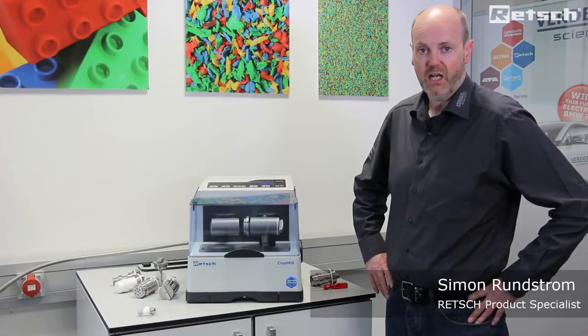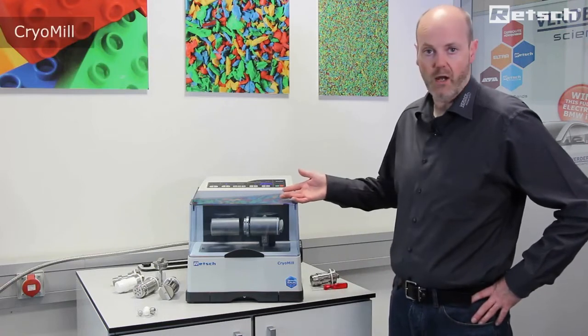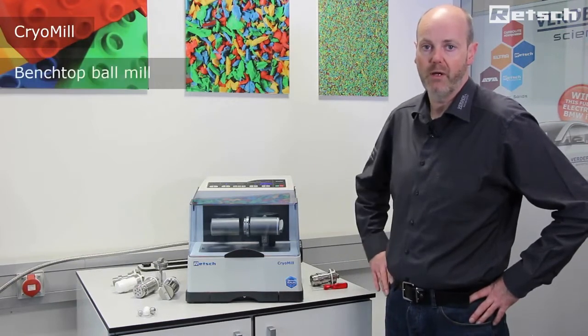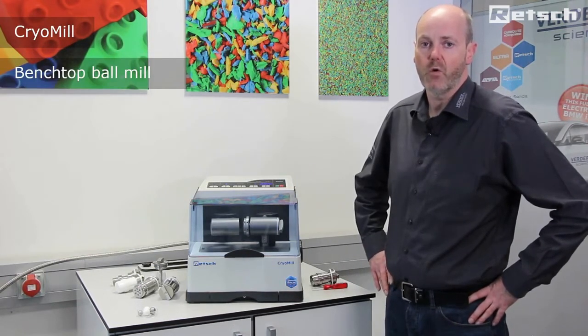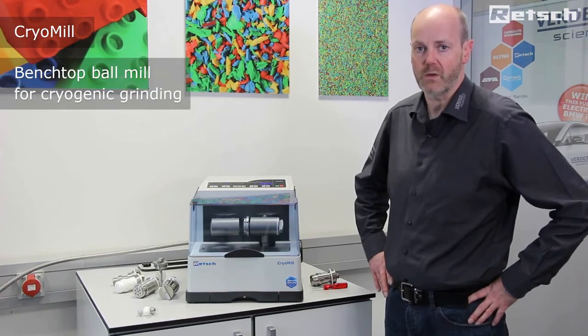Hello, I'd like to take this opportunity to introduce the CryoMill, which is a benchtop instrument that falls within the family of ball mills for the cryogenic preparation of sample materials.